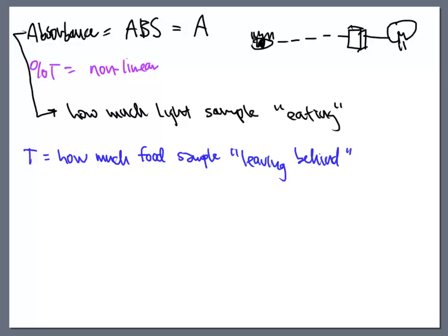However, the other point of perspective, and in this case absorbance, the molecule's walking down the buffet line and it's picking out what it likes and it's putting it on its plate. And that point of view would be like, gosh, look at all of that food on that plate that that person is eating. How are they ever going to eat all of that? And are they going to come back for seconds? That's the other point of perspective here.